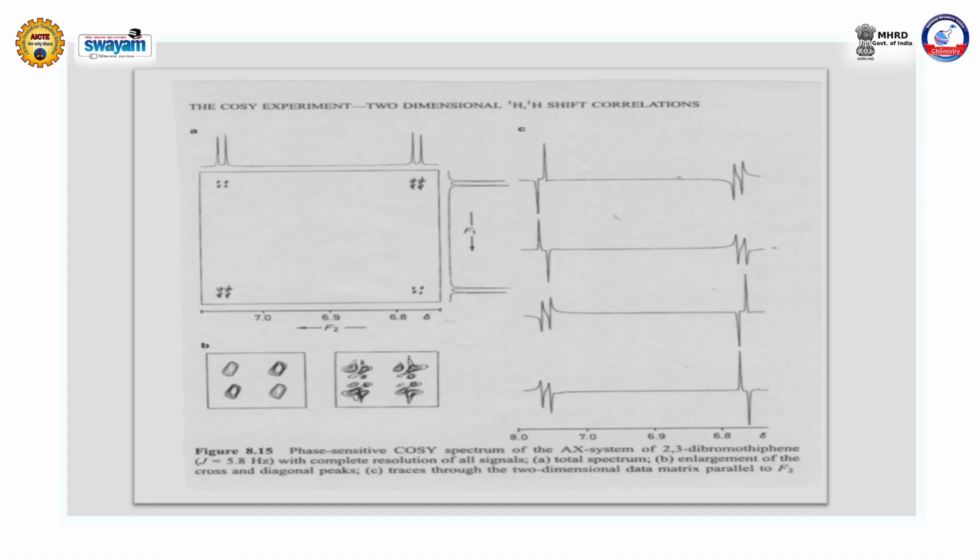Now here is an example of a spectrum which takes you into a little more detail. For a 2-spin system, if I have only two protons in my molecule, then I will have a doublet for each one of those. In your two-dimensional spectrum, I indicated one peak on the diagonal and one cross peak, but in fact this fine structure is reflected in the diagonal as well as the cross peak. So the diagonal will have 4 components, and the cross peak will also have 4 components, because along both axes you have two doublets.